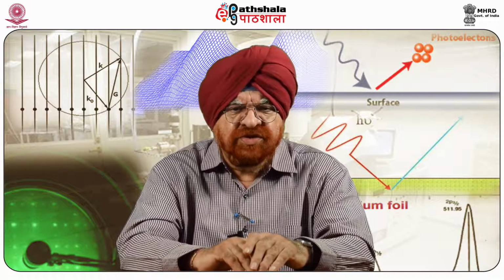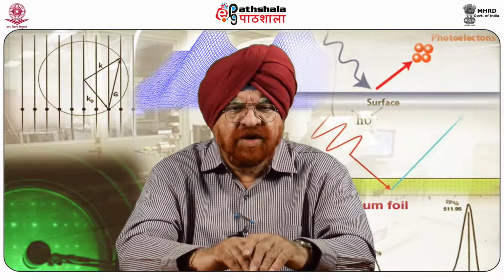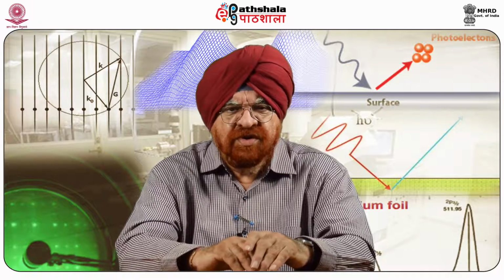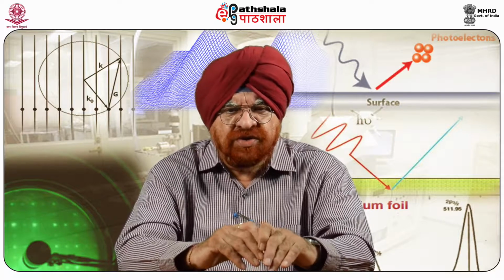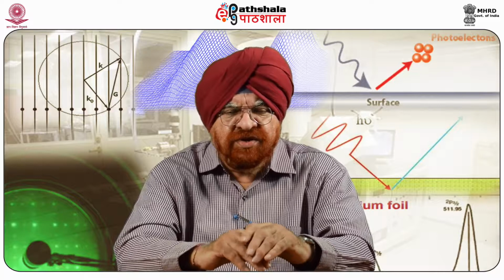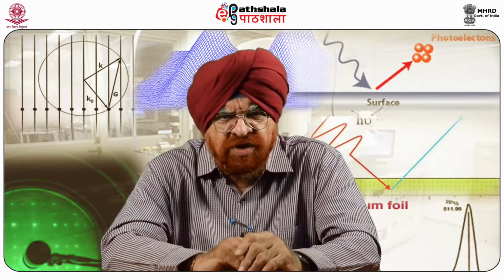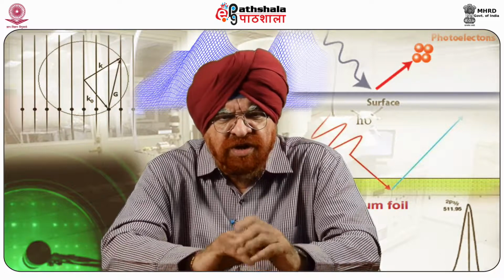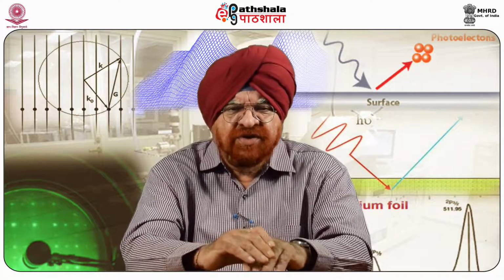Housing of the MFM system is important to shield electrostatic noise. It is also able to shield electromagnetic noise, that is, a Faraday cage is the one where this is carried out. Then for acoustic noise, a vibration table one can use to avoid the acoustic noise. Then air isolation can be done and airflow can be given. And static charge on the sample is the one which also provides difficulties.